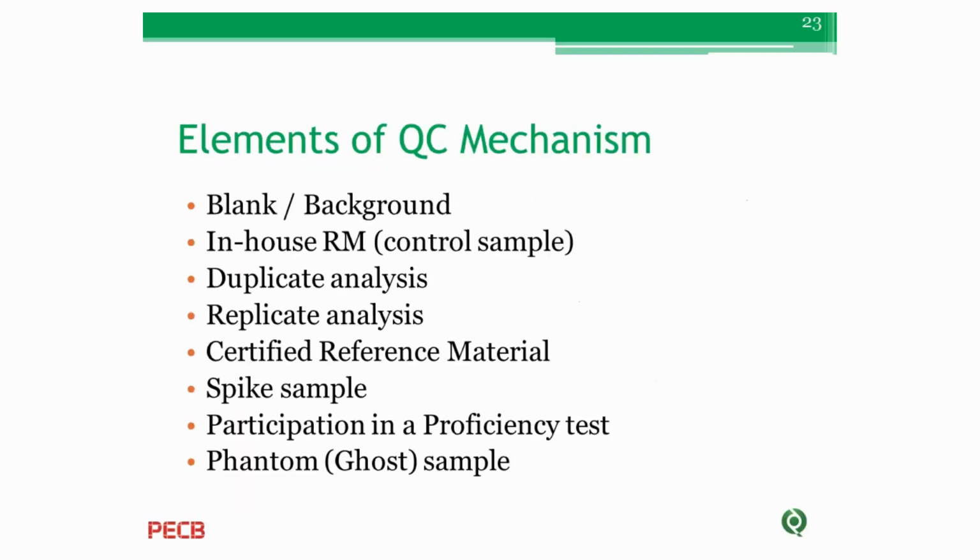Okay, this slide, we had it at the beginning, a similar one. Different mechanisms can be run in a laboratory in order to check the results. I would like to talk only about the last one, phantom or ghost sample.